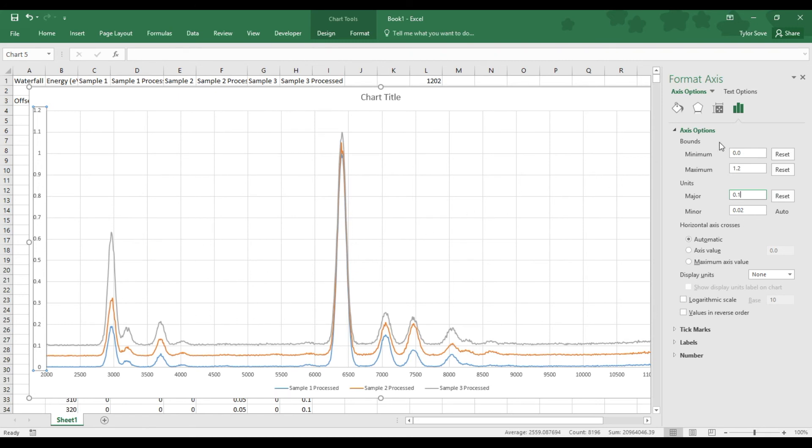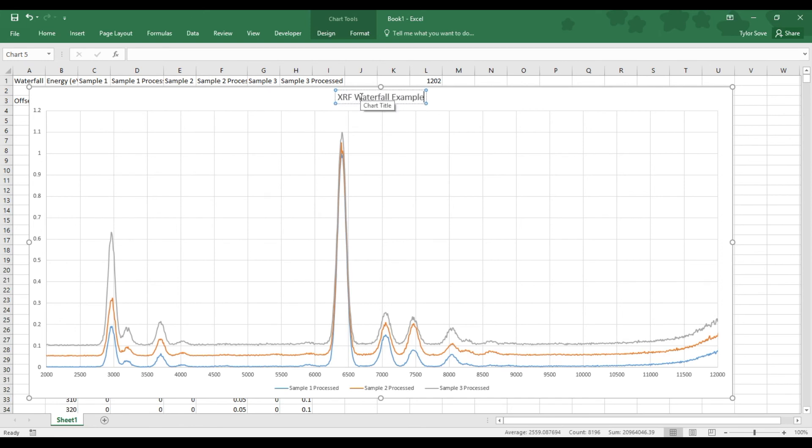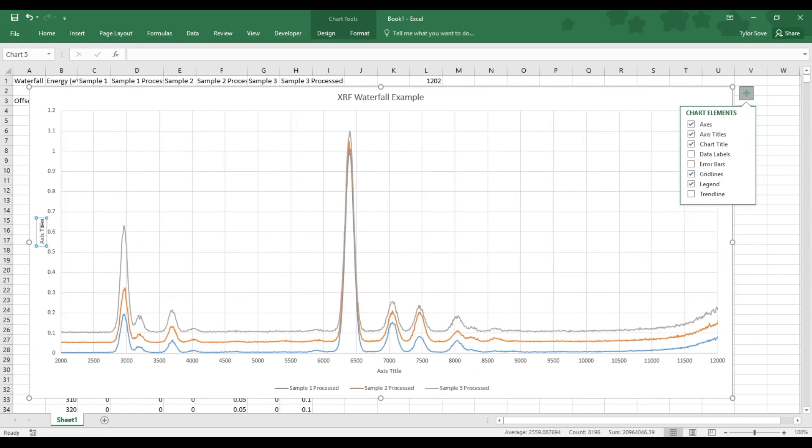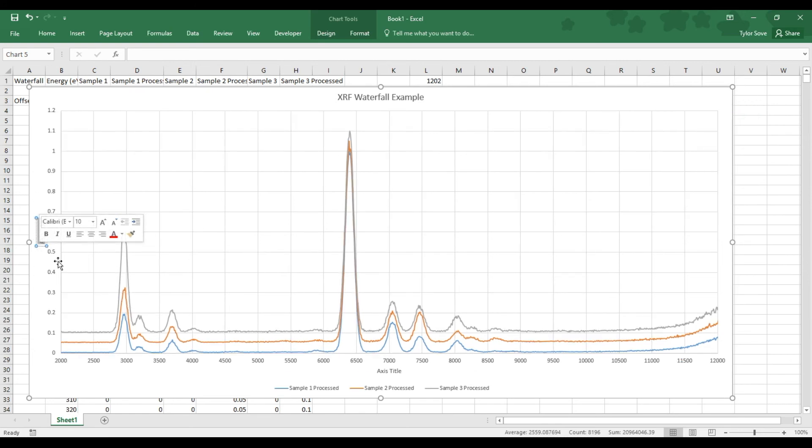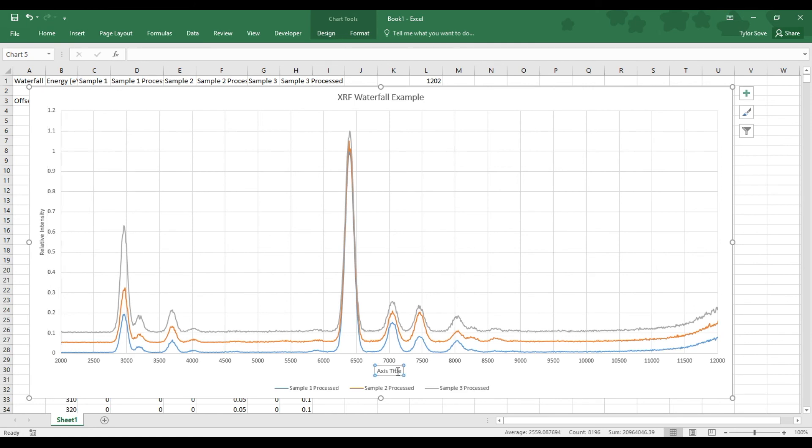Now the last thing that this graph is missing are titles. First and foremost, the graph title: XRF waterfall example. You'll probably put your sample name there. Now back up here to the top right to the green cross, which is our charts elements option. Choose the axis titles. Now over here under the photon count, which is what this typically is, because we have normalized our graph, this is now relative intensity. Relative intensity, perfect. Now under here, under the bottom, this is our energy. So I'll change that to energy, EV. There we go.